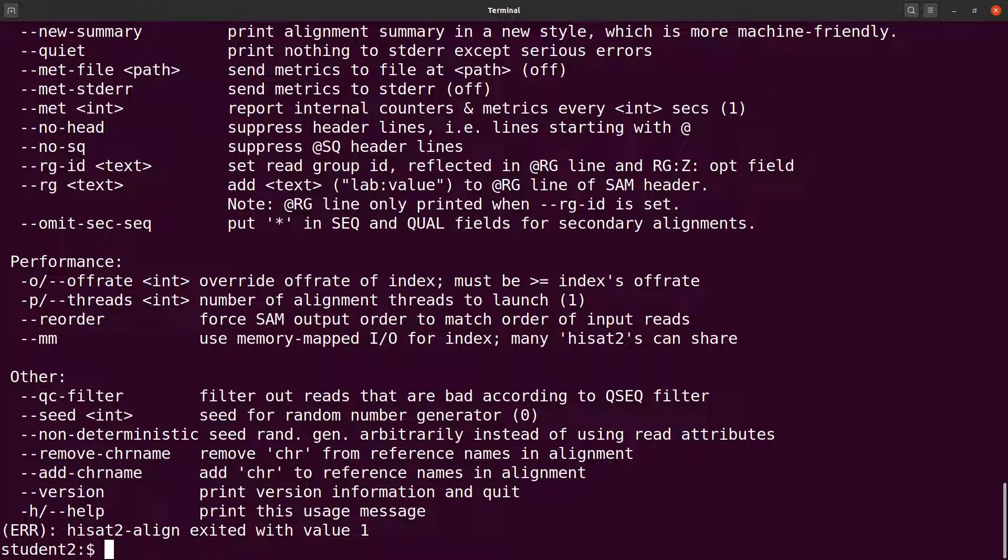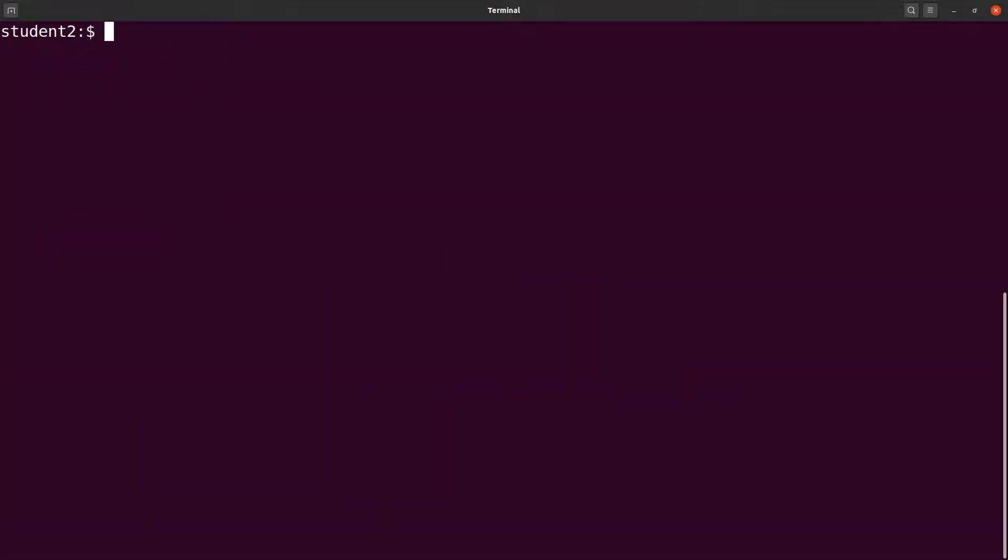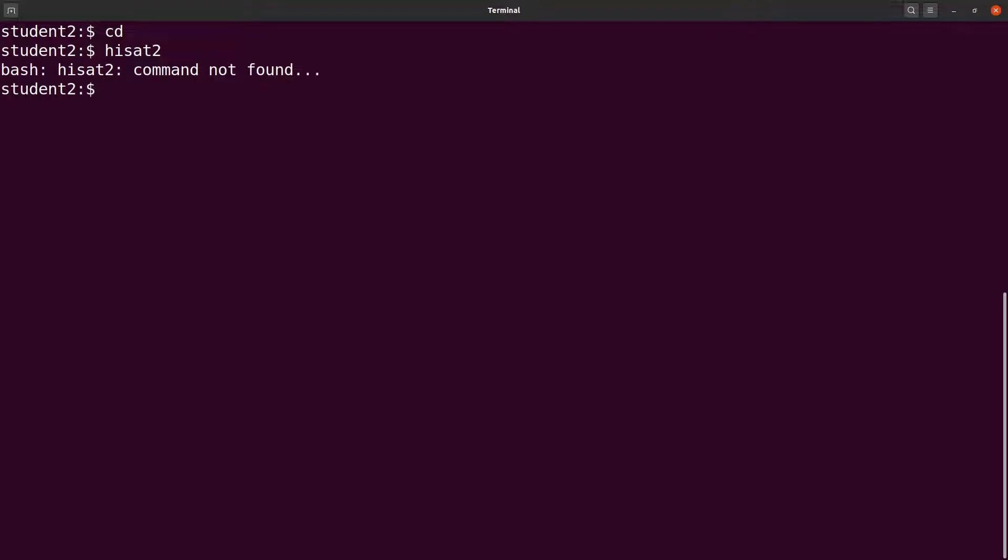Let's clear the screen first and then let's cd back. I just want to show you something. Let's cd back to the home directory. With the current setup, if you call HISAT2 like this, we are going to have an error. This is what I want us to fix.